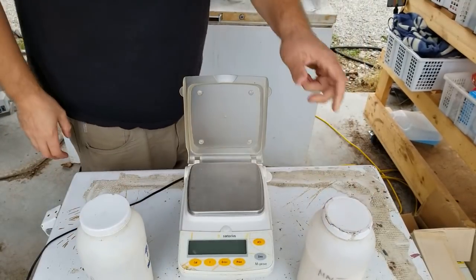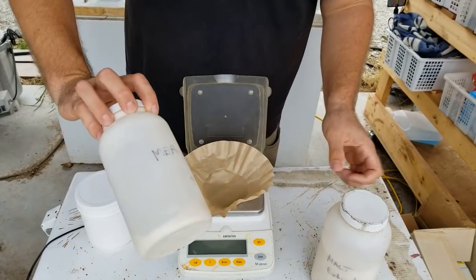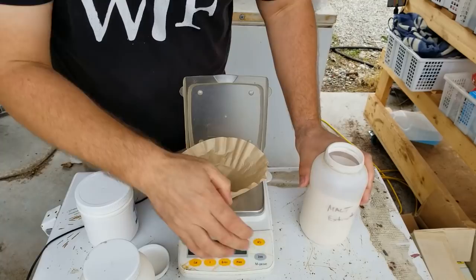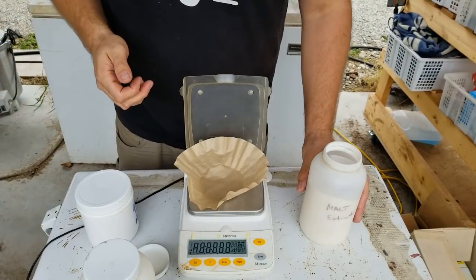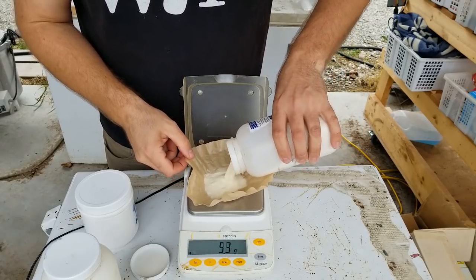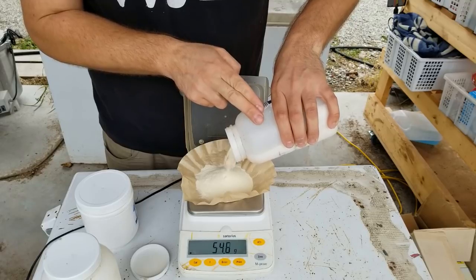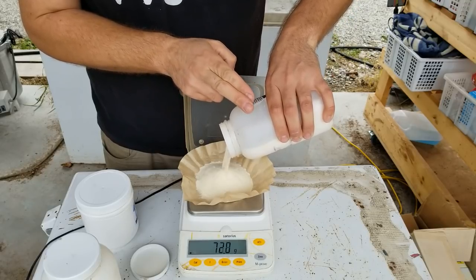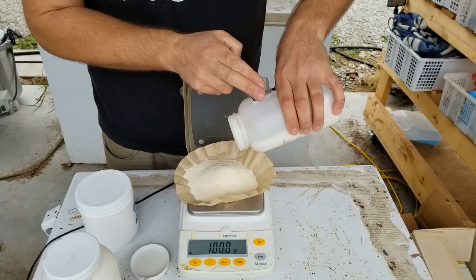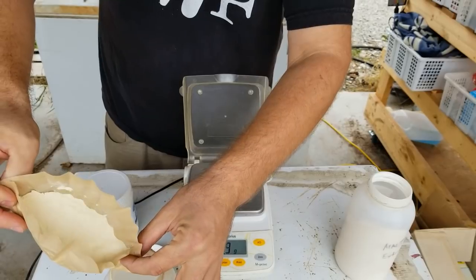Now I want to show you how I make malt extract agar, otherwise known as MEA. I like to pre-mix my own — I simply buy malt extract at any local brewery supply store. I like to buy the light powder and it's relatively cheap, about five to six dollars a pound. For today we're going to pre-mix some MEA: 100 grams of malt extract and 100 grams of agar agar. Your weights don't need to be absolutely perfect — anything close will do. You can buy pre-mixed MEA from reputable companies, but it's definitely cheaper to do it yourself. We just do a 50/50 mix of malt extract and agar agar.